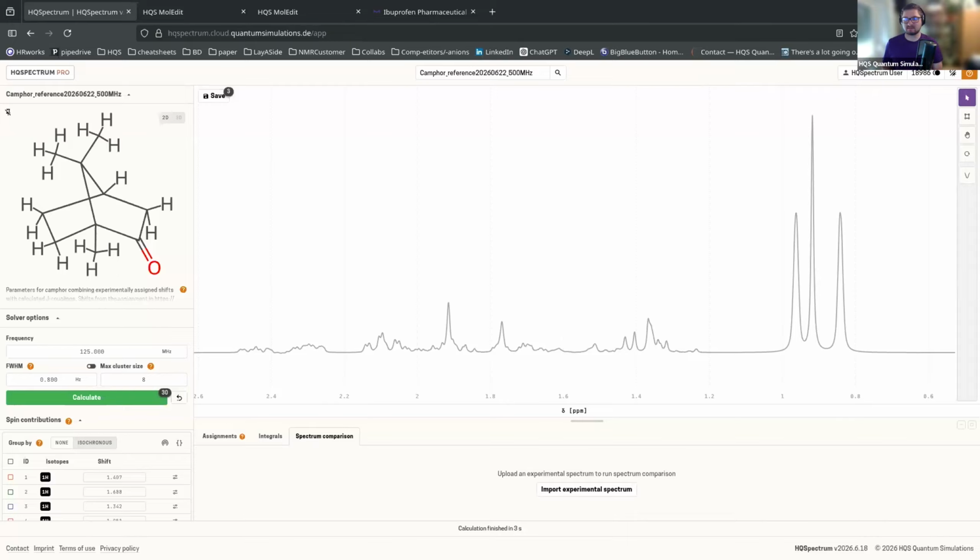As we said, there are interesting things ahead. So we are working on this mixture analysis. We are working on a structure elucidation workflow, which essentially is this verification workflow, but for multiple molecules at the same time. So you can identify which is your best candidate, for example. And you can play around now.